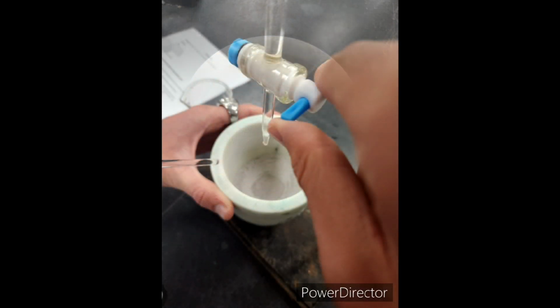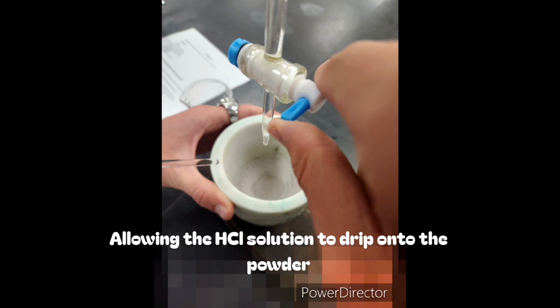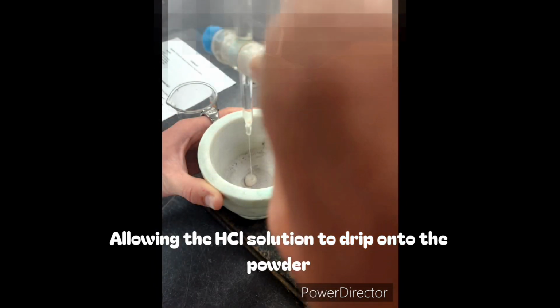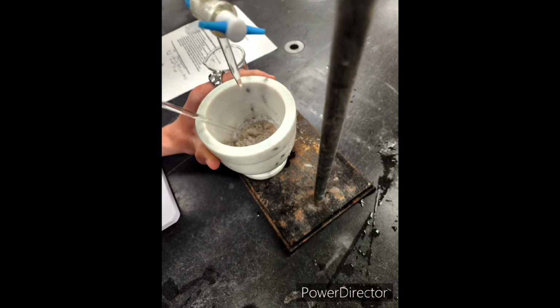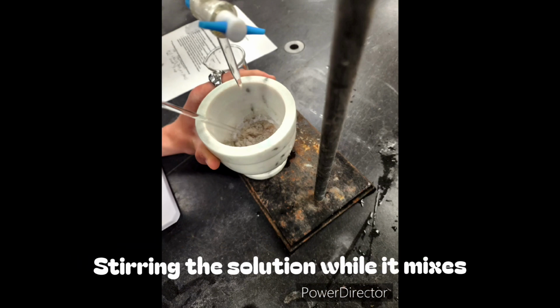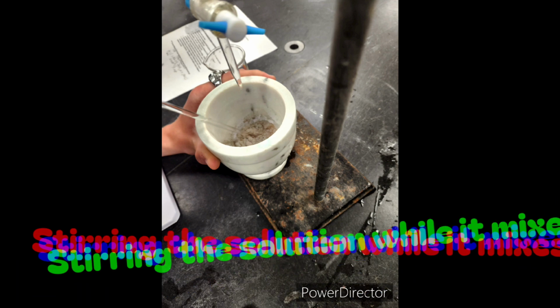Next, we turn the knob on the burette to slowly allow the HCl solution inside to drip onto the tablet. We continuously stir the mixture as more of the HCl solution drips into the vessel. The reaction is done when there is a noticeable lack of visual or auditory bubbling.